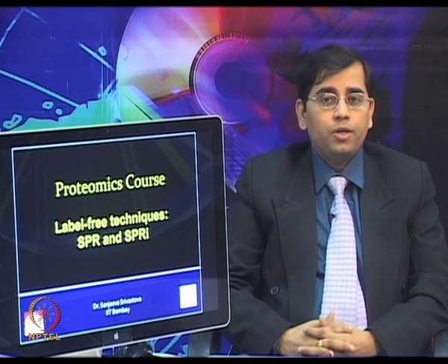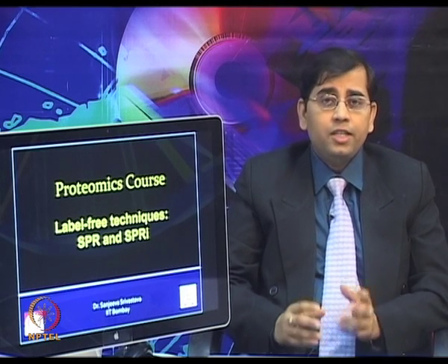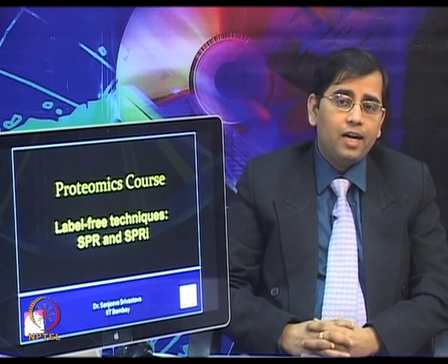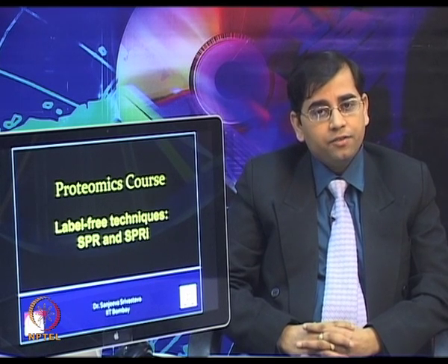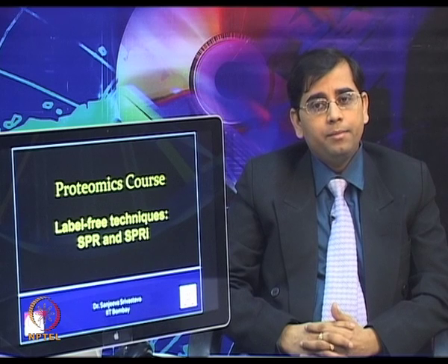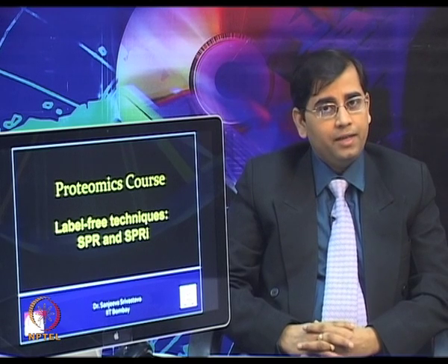Surface plasmon resonance, or SPR, is a popular surface analysis method which is used to detect changes in the refractive index or thickness of an adsorbed layer on or near an SPR active surface with high sensitivity. Commonly, the SPR measurements are collected for SPR imaging for various high throughput applications.